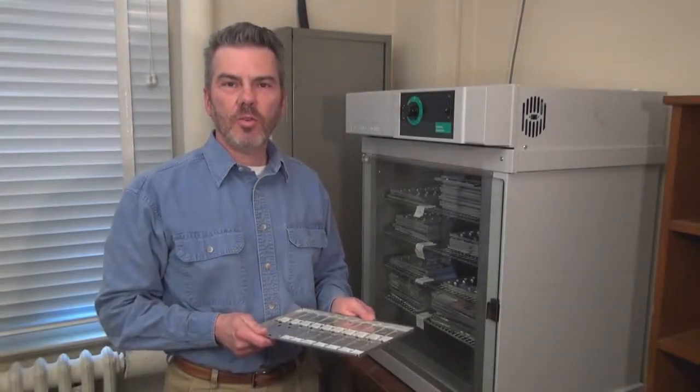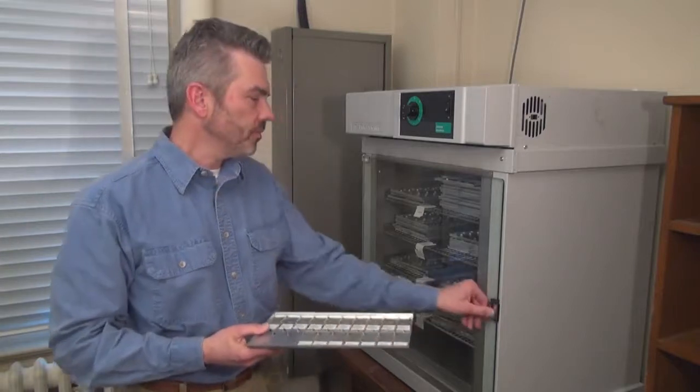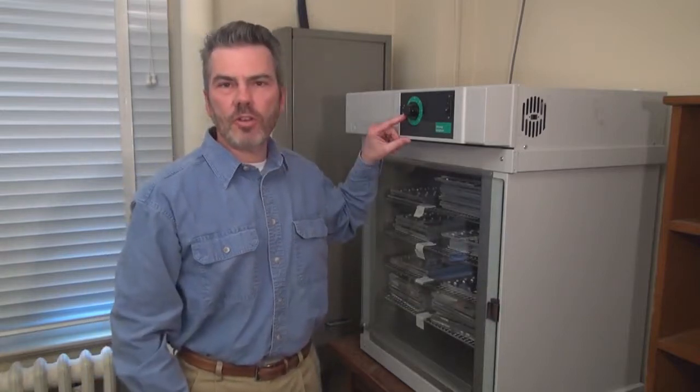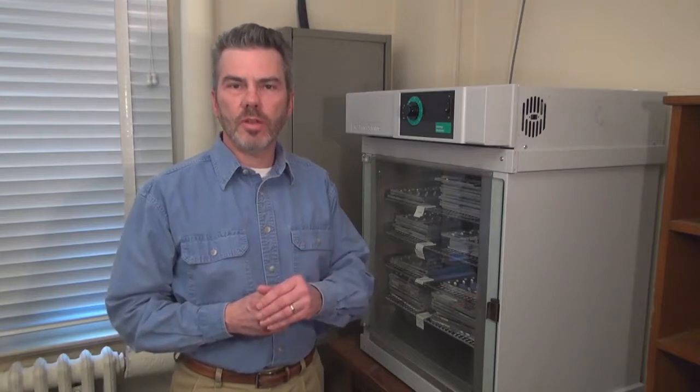Finally, you will want to label your slides and place them in a drying oven, such as the one we have here. We keep the temperature set at about 30 degrees centigrade. And this is important because it allows the mounting medium to set. The length of time required in the oven depends upon the thickness of the microscope slide mount.